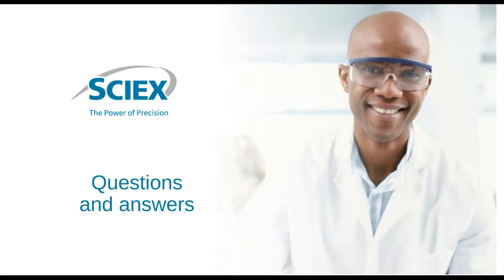But I would guess about 20 minutes is a fair estimate for a separation time. It might go up to 30 if you're looking at something relatively big and need to keep the resolution between the peaks. I think 20 minutes or so is probably a fair estimate for separation time.